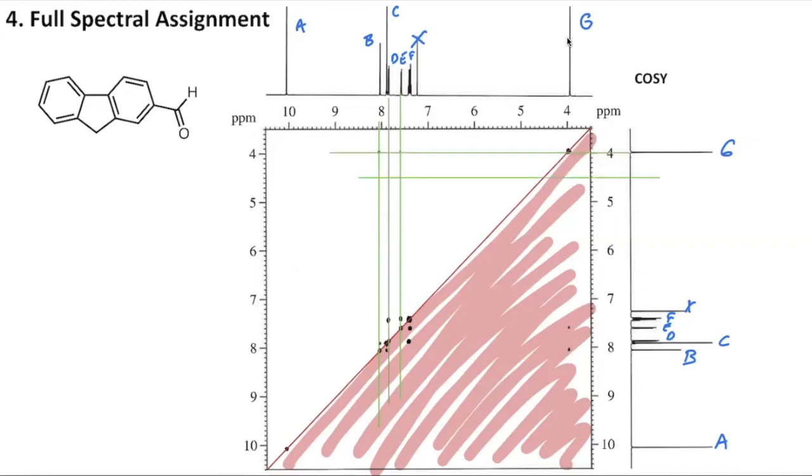And then we'll paste another one in so that we can see all of the other correlations that we need to. So there's 2 there. I think we need one more to get this little tiny baby cross peak here. That looks about as good as I think I'm going to get it.